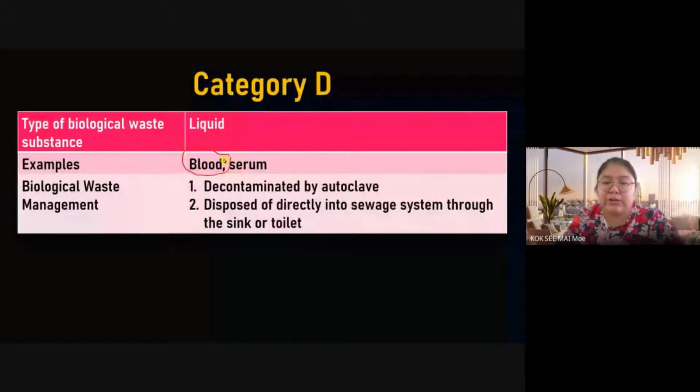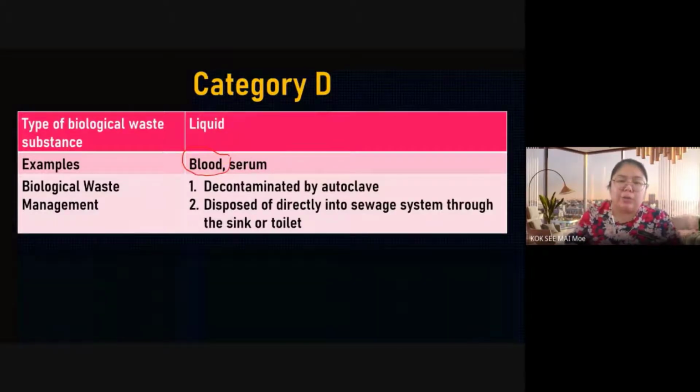But this one cannot say I use halfway, then I send to the blood station. No. Okay, so this one is extra blood where they want to put. Okay, another one, the serum. Now we see it is decontaminated by autoclave. Also the same, you need to autoclave.